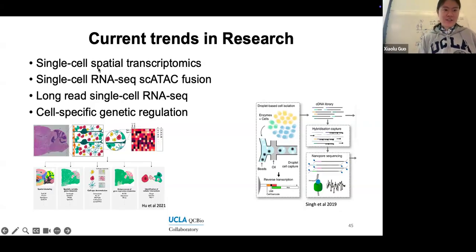And similarly for spatial, single cell doesn't have spatial information, and spatial has spatial information. However, spatial transcriptomics covers even less. I would say less than 1% or 0.3%, some number like that. Less than 1% of mRNA is captured by spatial transcriptomics.